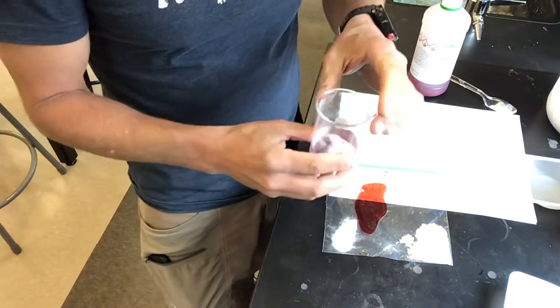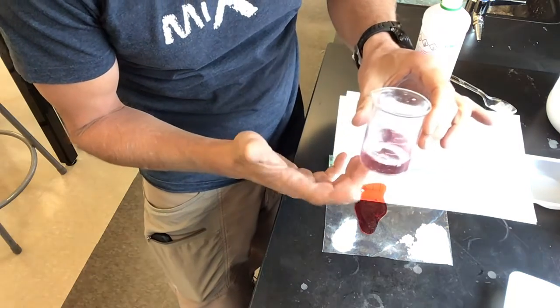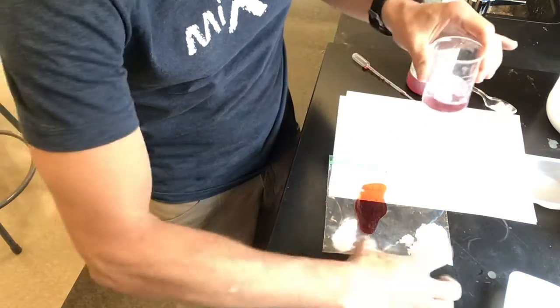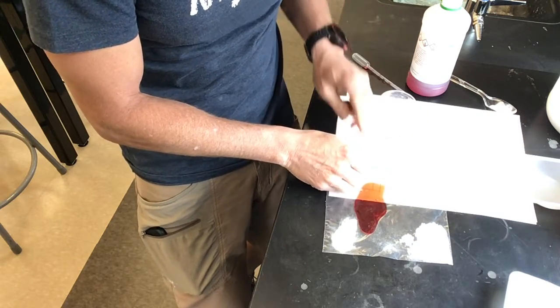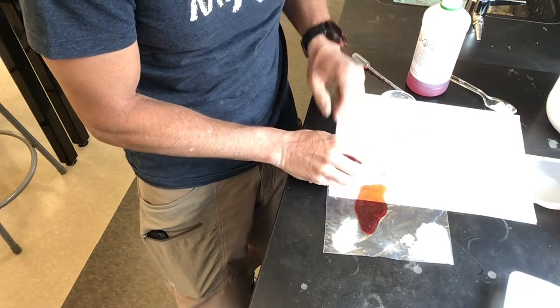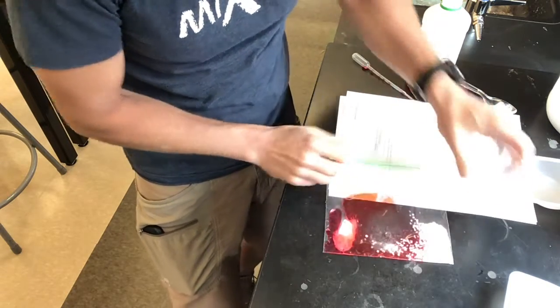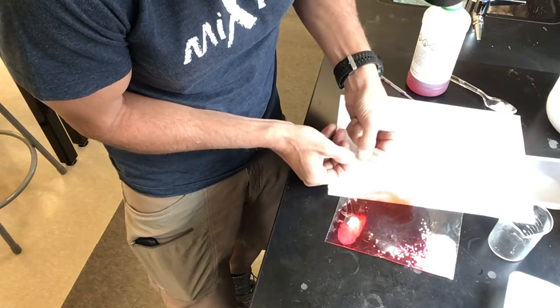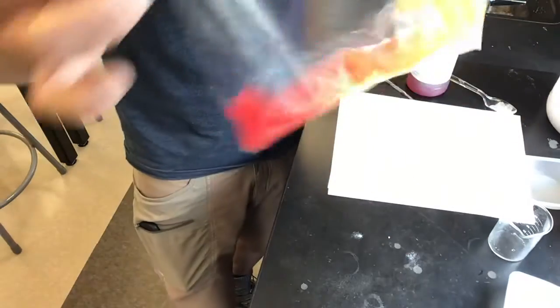The amount isn't really important, just so long as you have enough water to dissolve the solids. So I'm going to add the water, close the bag, and mix it up.